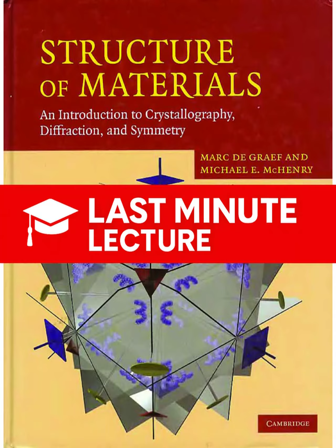Yes, the Bragg angle. And then you just ask, what's the condition for constructive interference? We want the path length difference between a wave reflecting off the top plane and a wave reflecting off the plane right below it to be an exact integer number of wavelengths. And a little bit of geometry shows that this path difference is exactly 2d sin θ. Which gives us the most fundamental equation in structural analysis, 2d sin θ = nλ. It's just remarkably elegant. It links the material property we want to measure to the experimental variables we control, the wavelength λ and the angle θ.